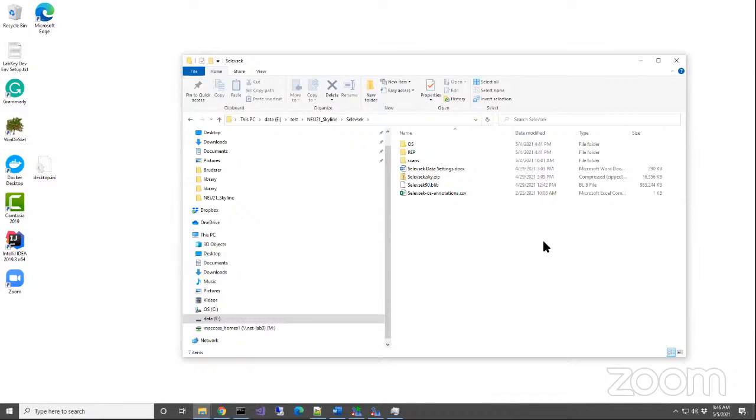Then they said, "Whoops, we forgot to run this calibration tool," and they ran it, and the data worked much better. So if you can recalibrate the data using a vendor tool, that definitely can be super helpful, because then it can stay in place.